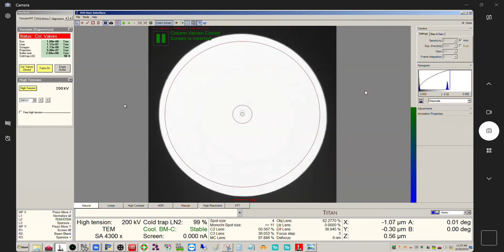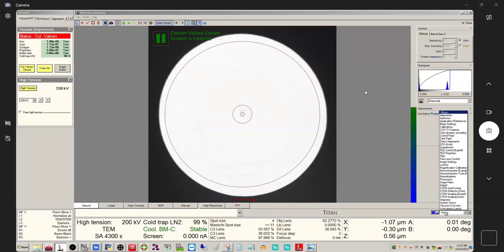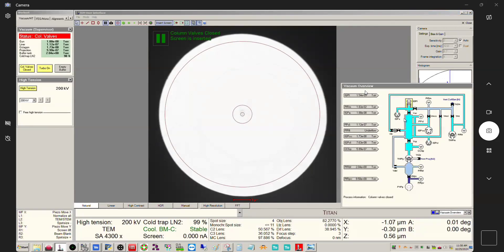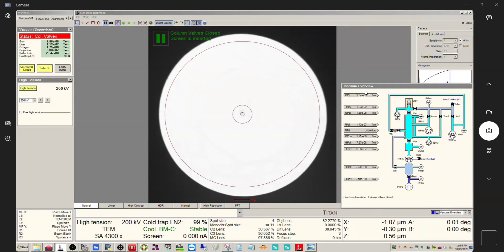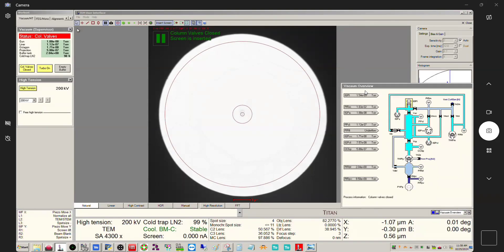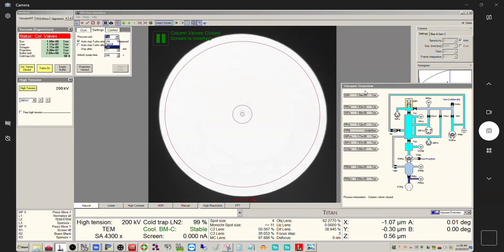So let's start by where can you find the vacuum system diagram. Come down here, find vacuum overview, and you can see your overview here. Right now I have all the units in Torr. If you want to change this, find your vacuum control panel, wherever that is. If it's not already over here, you can find it, click settings, and you can change the units.